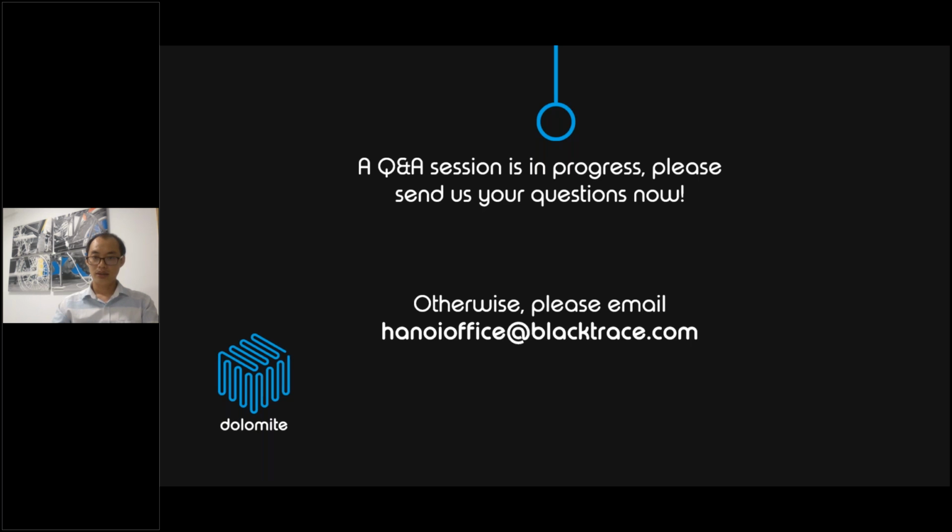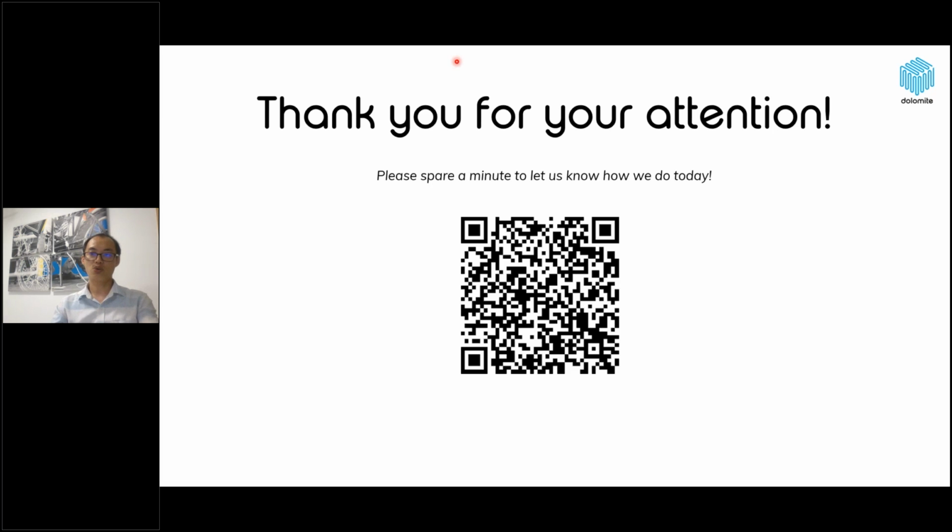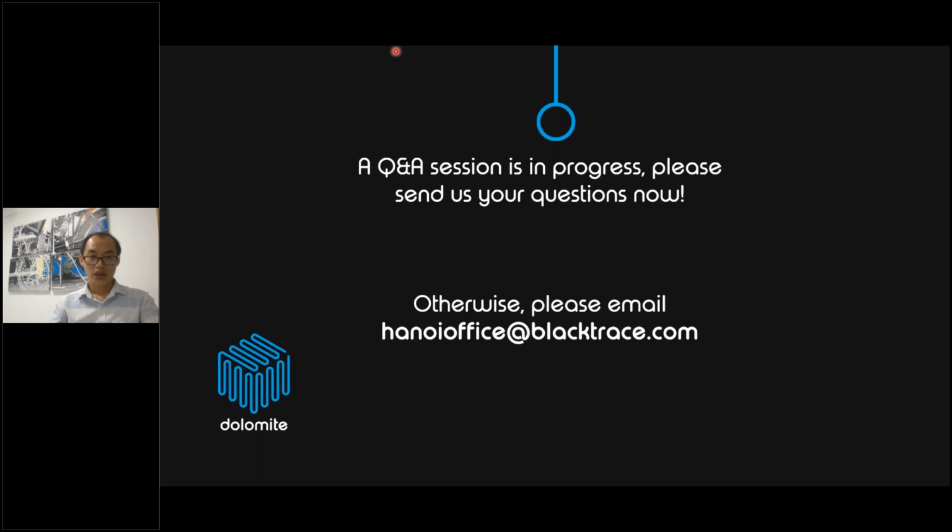Okay, is there any question? Okay, I got one more question. How will be the distribution of the hydrophobic drug in the microparticle? Will it require sonication to get uniform distribution?